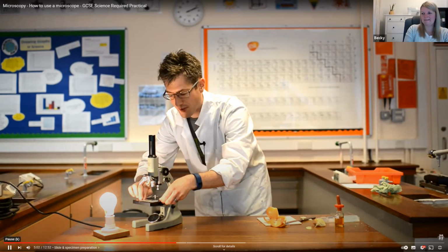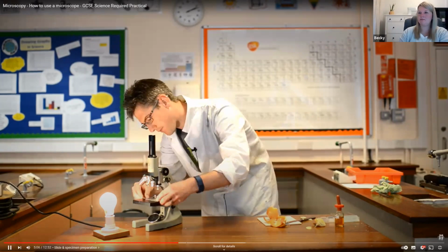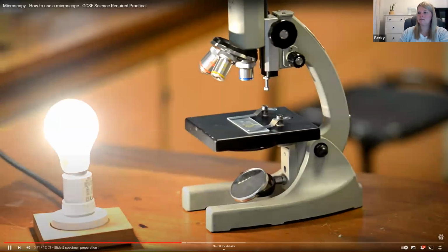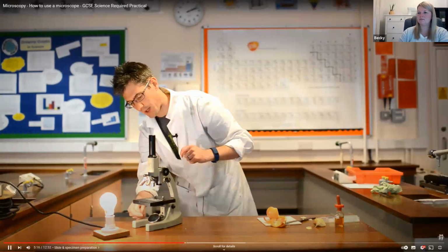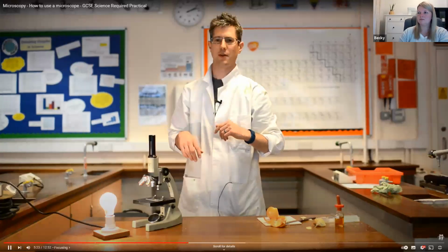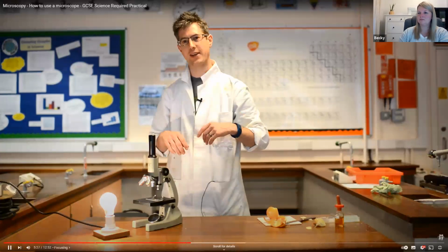These clips are used for holding the specimen in place. Might sound silly, cover slip goes up, otherwise the microscope will not focus properly. So the cover slip is on the upper surface of my glass slide now. So we now have light coming up through the specimen that is now on the microscope stage. It's now to the point that people find most difficult. And this is where people find microscopes very frustrating, as they cannot focus properly on their specimen.